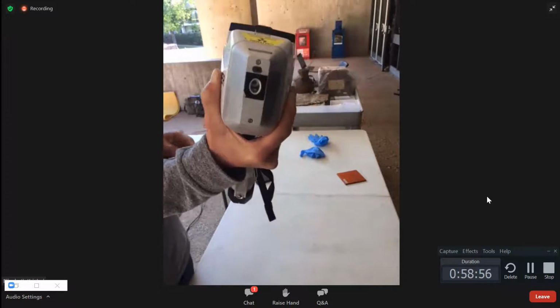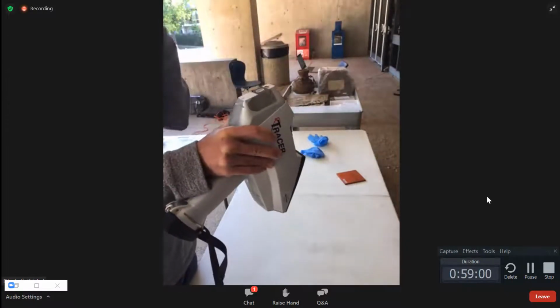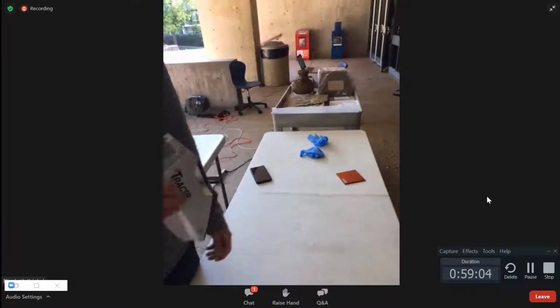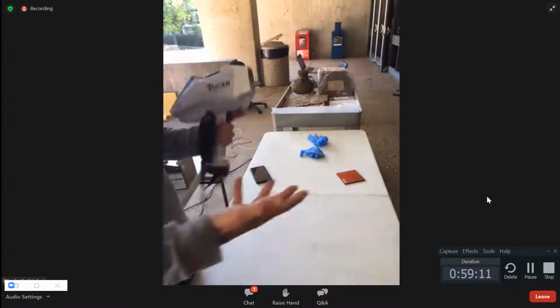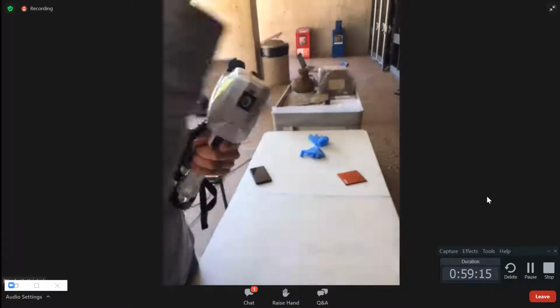But in any case, with one of the older instruments, I had a rupture. I put some rare earth powder on it, and it got all over the detector. So everything measured by that unit had that as a contaminant, and we decided to live with it because it was just a demo instrument. But we also had to recalibrate everything. It was a pain. But these, you can see here, it's just a sticker, you pop it up.